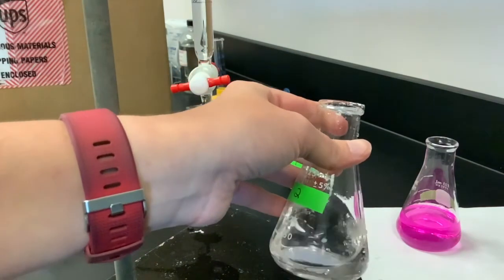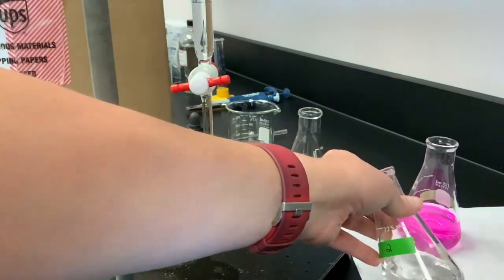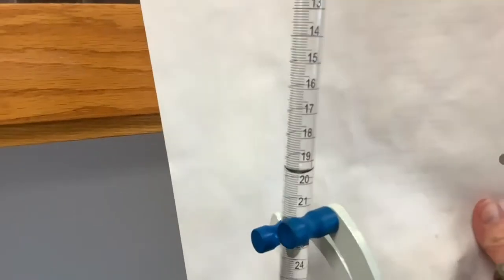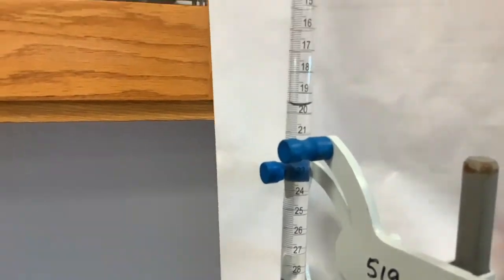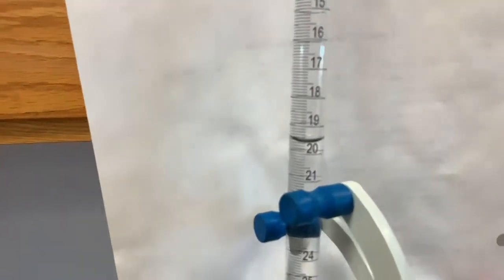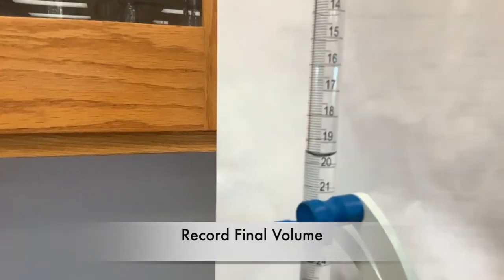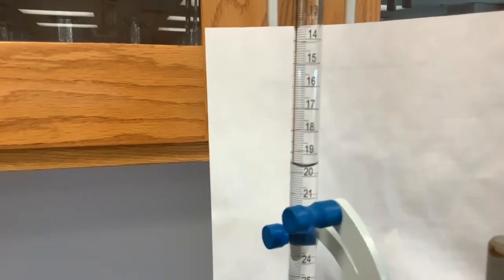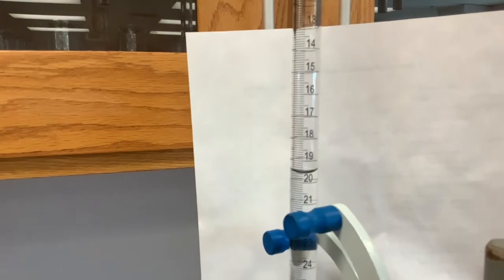Pink will go away as long as it is persisted. We still have a very light pink, and we're good. So we'll go ahead and record our volume measurement.